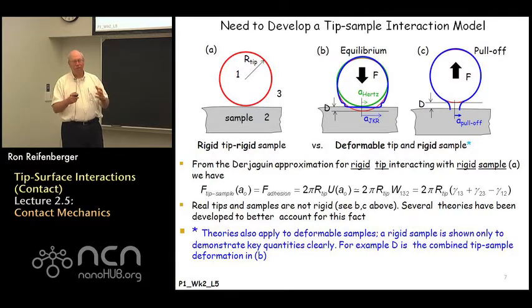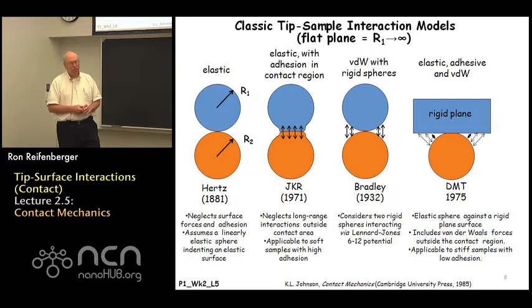But that's a very simple approximation, a very simple model. More realistic models are going to relate the adhesive neck that forms when the tip is pulled away from a substrate, and so that's going to relate to the pull-off force in a very important way. So we'd like to incorporate that into our discussion of the tip-sample interaction. The classic tip-sample interaction models are sketched out schematically in this diagram.